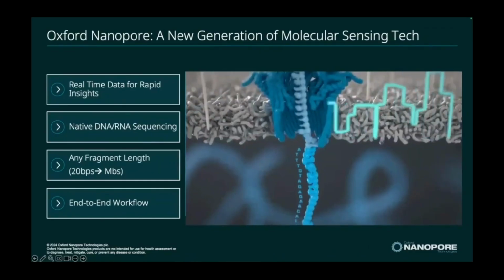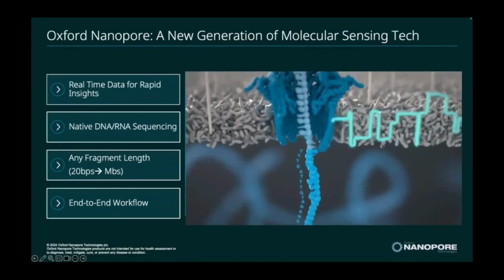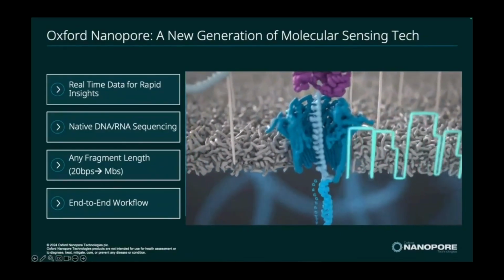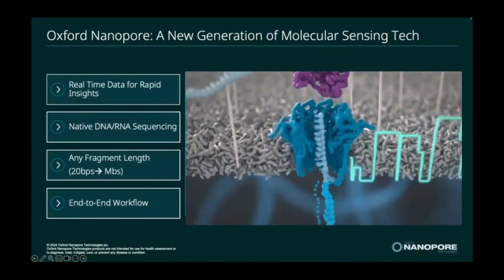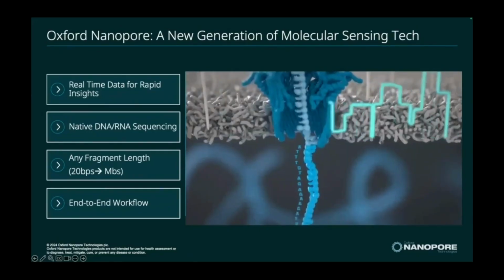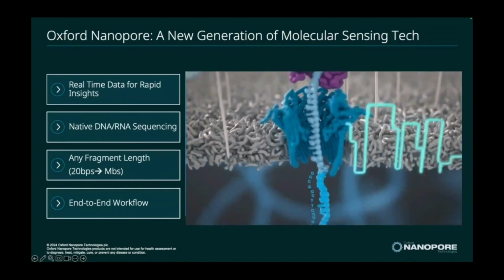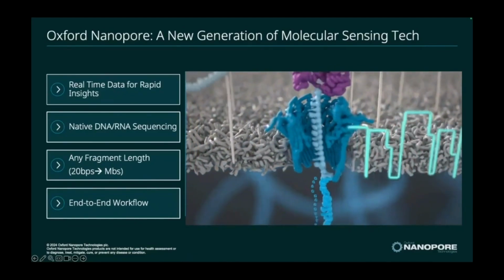Embedded in a membrane, the DNA or RNA passes through this pore and emits a unique electrical signal that can be read. And these squiggles you see here on the video are each slightly different. An A is different than a T and versus a G. And importantly, a methylated C is slightly different than a non-methylated C. These unique properties of the nanopore sequencer provide both the genetic and epigenetic information from a sample, making ONT a perfect platform for multi-omic studies.